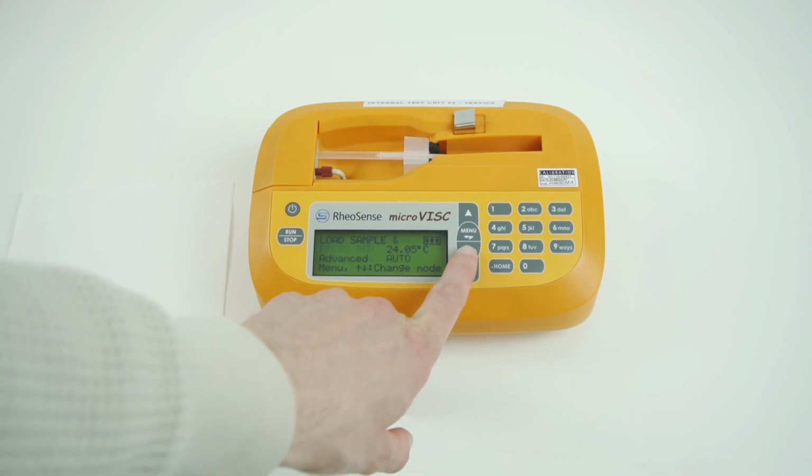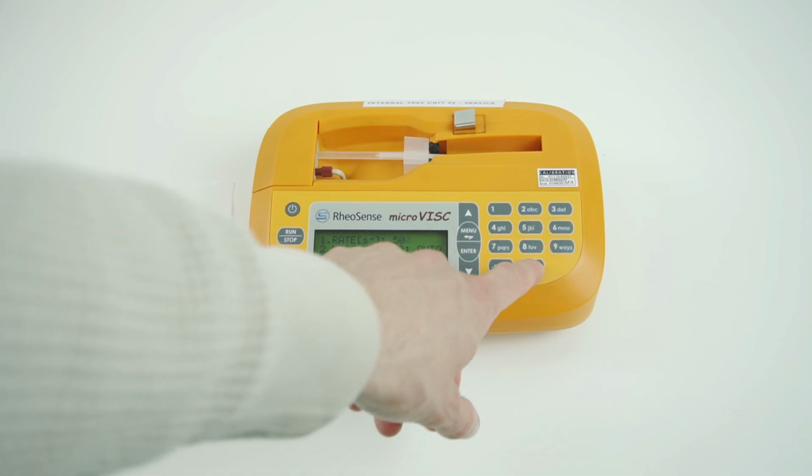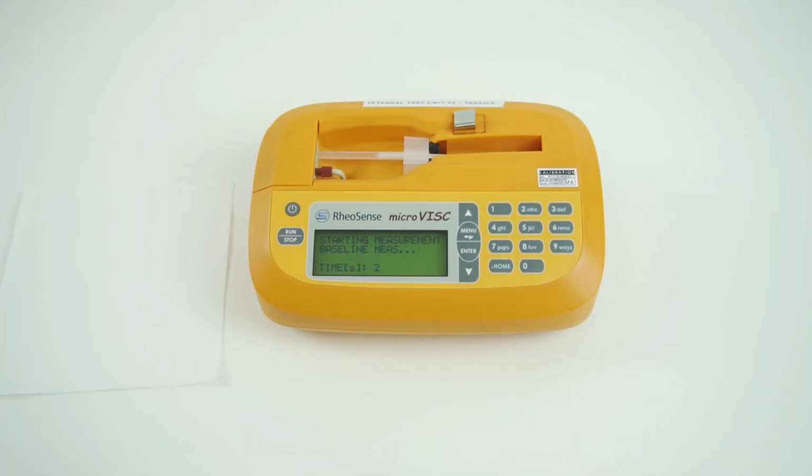Now we'll go into advanced mode and pick our starting shear rate, 500 inverse seconds today, and hit run. Now that sample is going to run on the microvisc until we have a complete data point, and then I'll go back to that advanced measurement screen, set a new shear rate, and then I'll repeat that process until I have every shear rate that I'm going to need to build a complete viscosity profile at a full range of shear rates to see that non-Newtonian behavior.